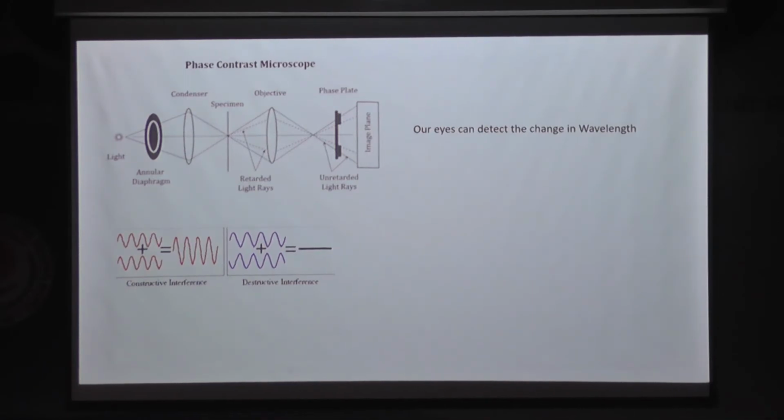In the specimen, the nuclei will look different from the membrane, or from the cytoplasm. The nucleus, cytoplasm, membrane or any other granules will have different refractive indices. Even if the light going inside is common, the light coming out of the nuclei, the cytoplasm or the membrane differs, because we are not just talking about the cell, we are bifurcating the cell again: how is the nuclei, how is the cytoplasm, how is the membrane?